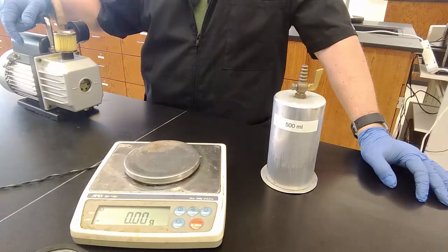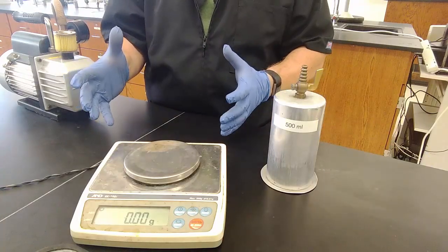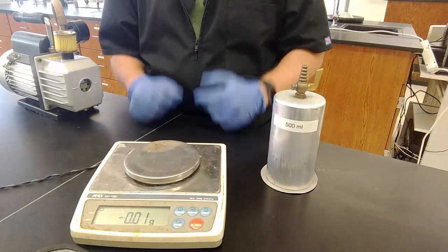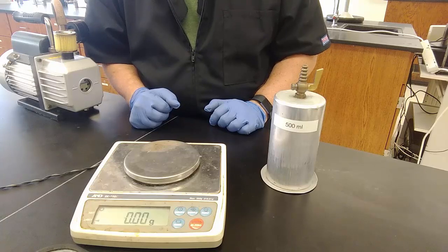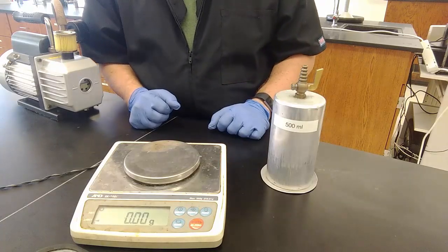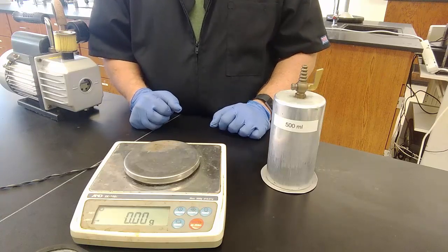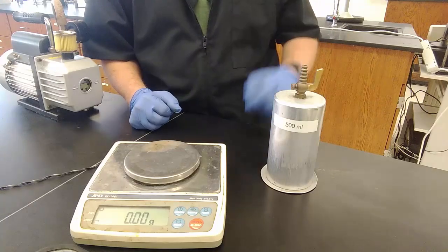So we're confirming the density of air. If we had an unknown gas, say trapped in a balloon or something, we could use the same procedure to figure out its density. Just weigh the balloon with the gas in it, and then weigh the balloon with the gas not in it. As long as we had the volume of the balloon, which we'd have to figure out some way, we could again get a mass and a volume and know by calculation the density of the unknown gas. But we're just going to do air.